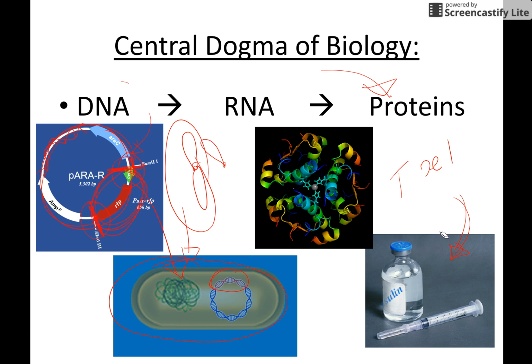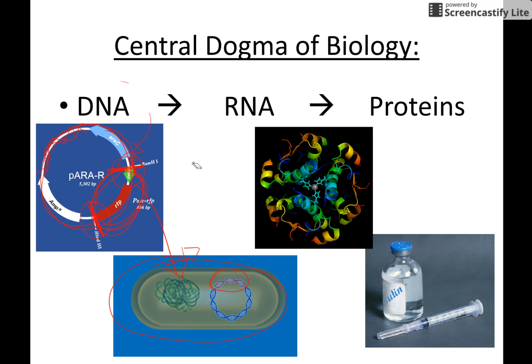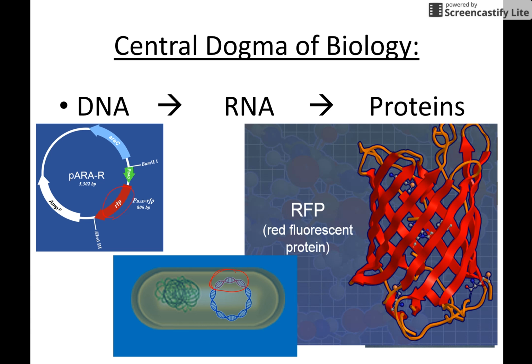And if I show you guys what this actually is doing, instead of making insulin, which would be super cool to make in our lab, but insulin is actually clear like water, so it's not that exciting to see. We're going to be using something called the RFP gene, which is actually a red fluorescent protein found in a sea anemone. So we're going to be using that in place of the insulin gene to represent any gene of interest that we might want to put here to help somebody in need of some medical protein to live a healthy, normal life.